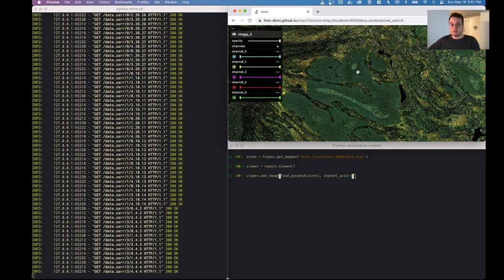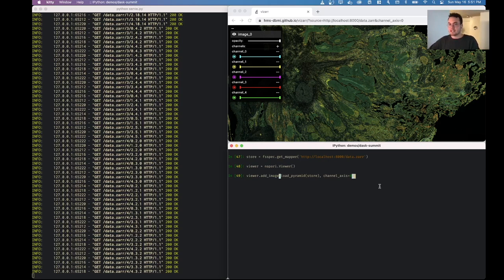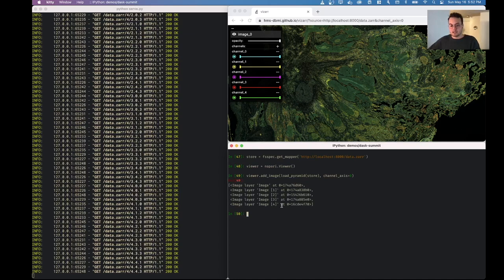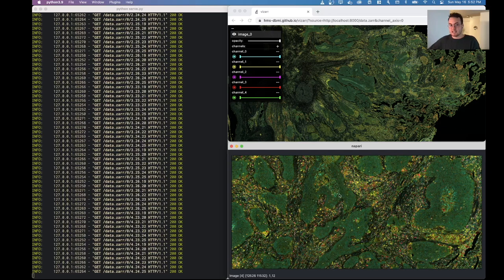And then similarly, in the Python ecosystem, I can connect to this remote data set in a separate process on my machine and view the data set in Napari as well. So here I have that multi-scale data set, except rather than it using the store directly, it's accessing an HTTP endpoint.